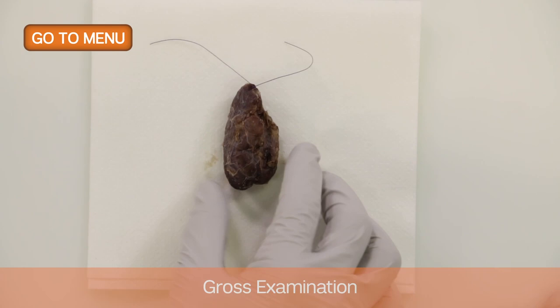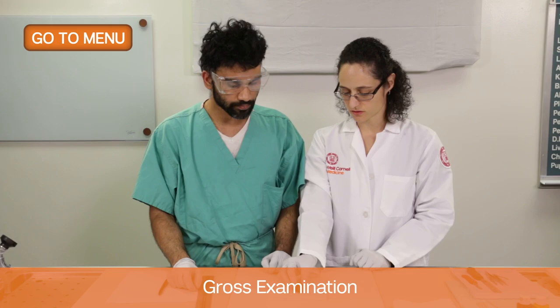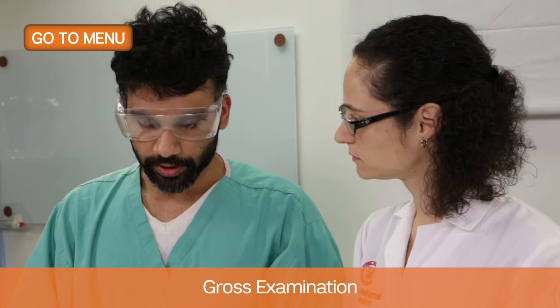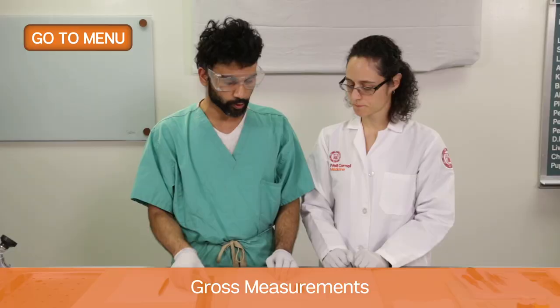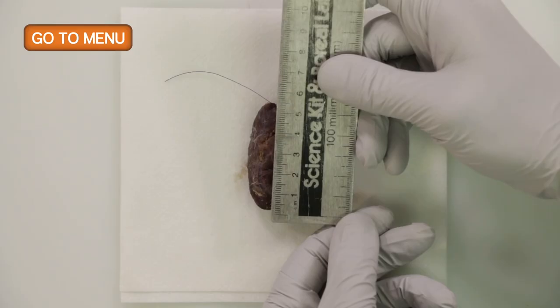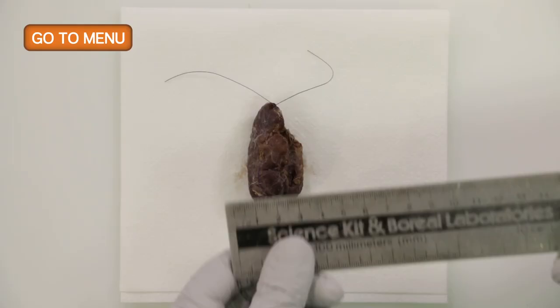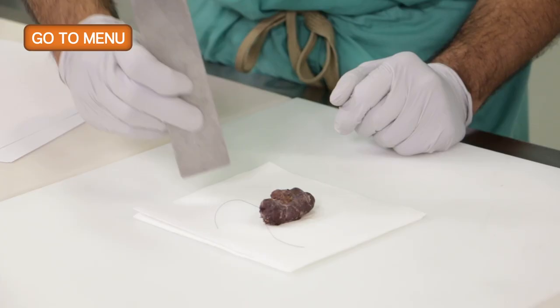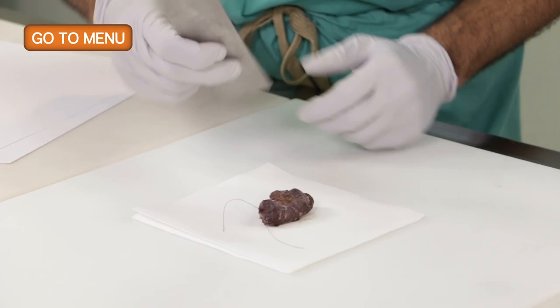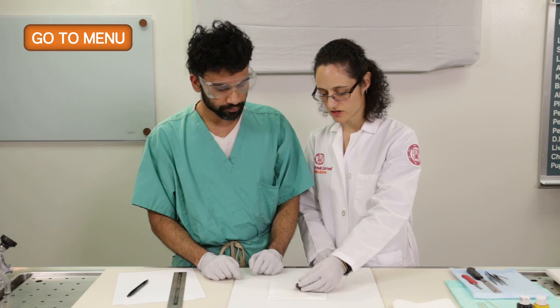After we have correct orientation of the specimen, what else do you want to do? The next thing we should do is measure the specimen. Typically you're going to do three dimensions. You measure the long axis, which is 5.5. You measure the width of the specimen, and that's 3.0. And then you measure the height of the specimen, and that is 2.1. So you've measured the dimensions of the lobe.